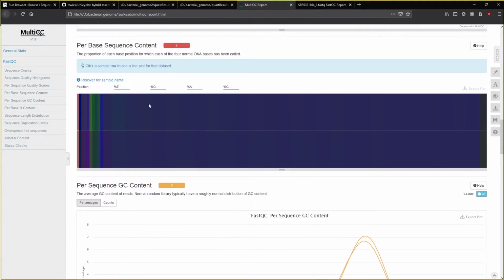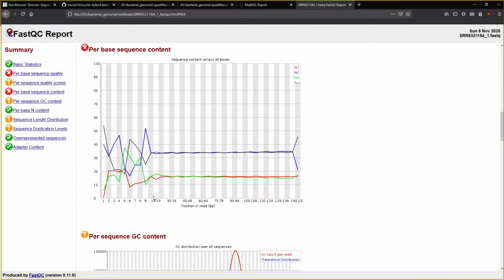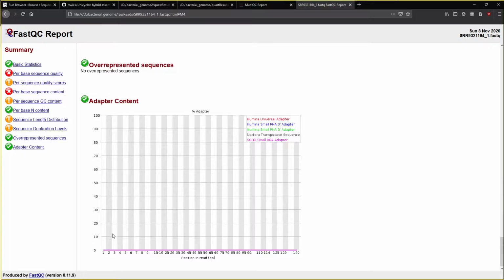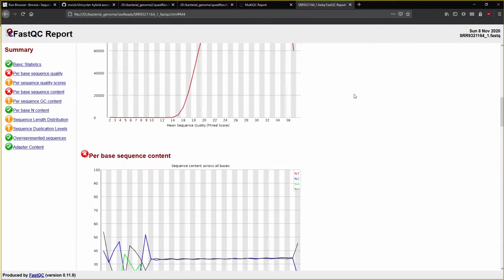So this is why I took this guy, and so we can see here, I've run it 2 different times, and that is what I'll show at the very end up here. One time I did a head crop, so I chopped off the first 15, which is this noise that we see. And then another time I left that in, and I only did adapter removal, which it doesn't look like there's any adapter content at all, but just to be sure.